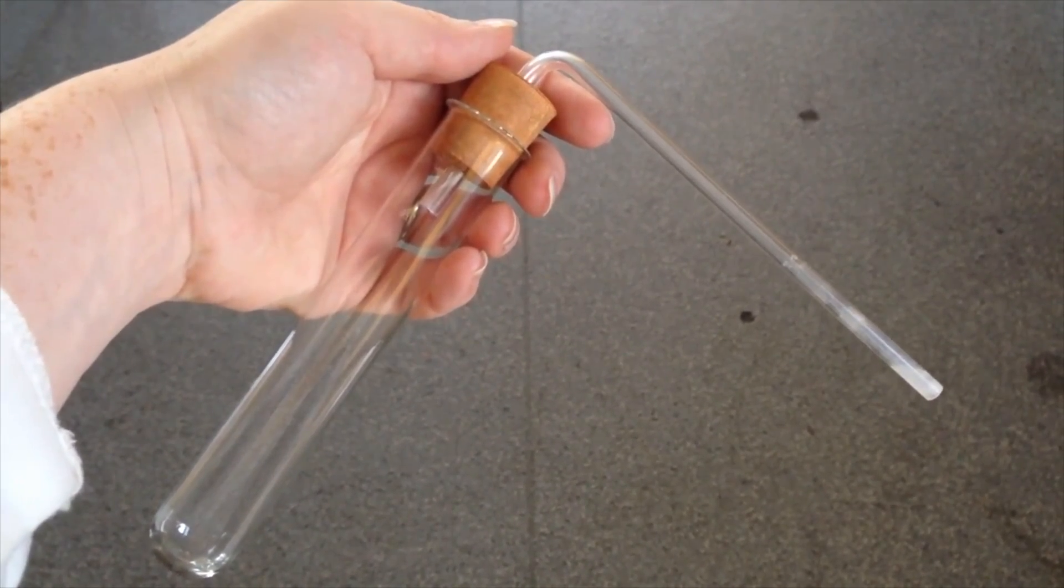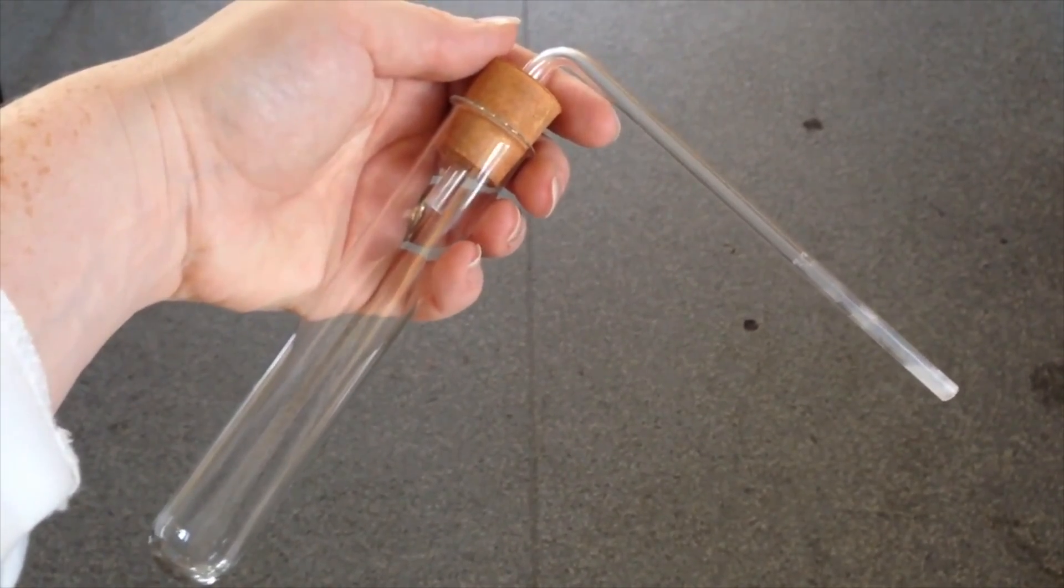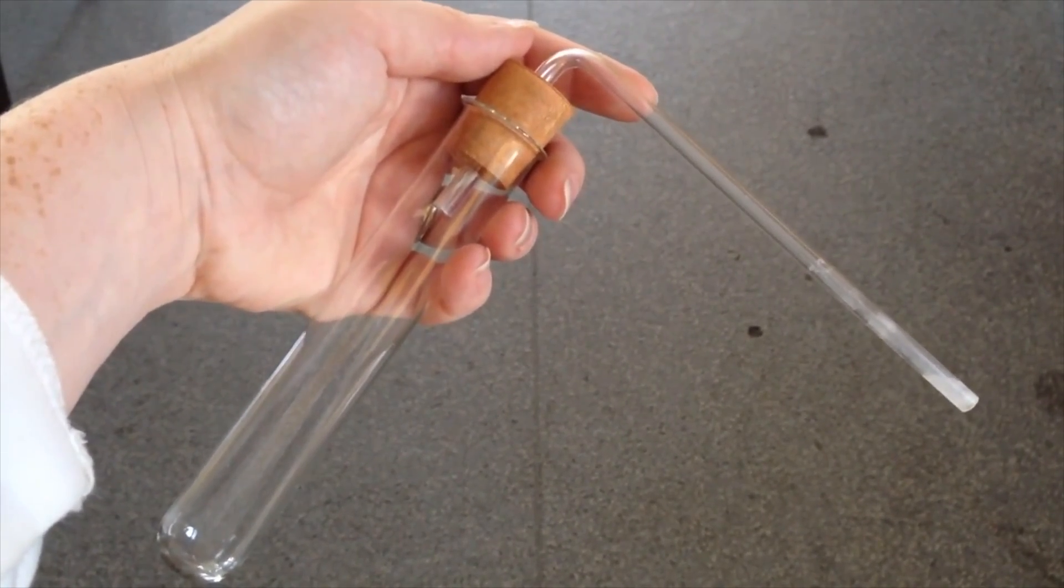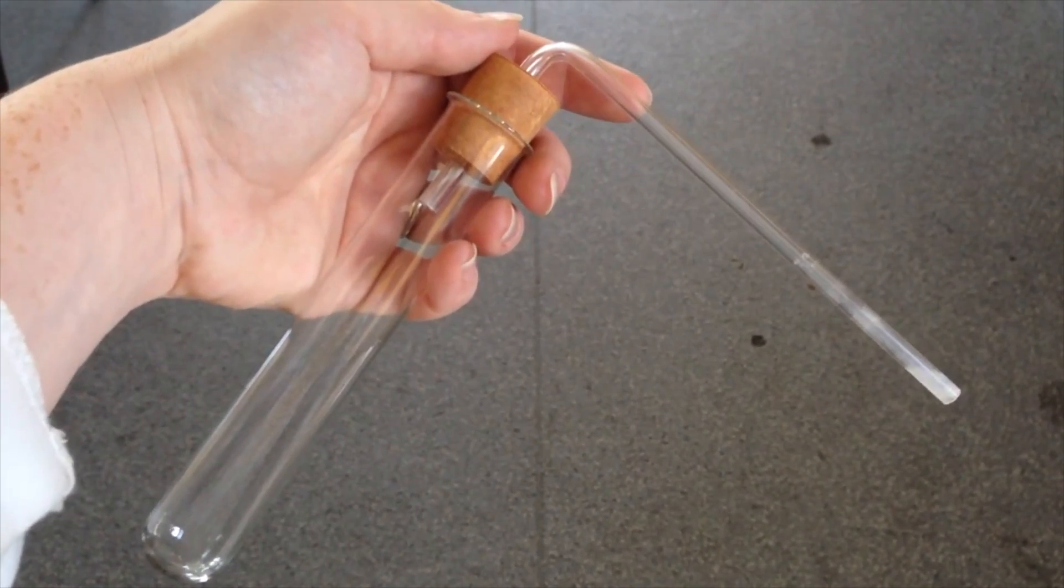So if your school doesn't have all the fancy quick fit glassware, you may have just used a boiling tube with a delivery tube which will connect to the condenser and send that into a test tube.